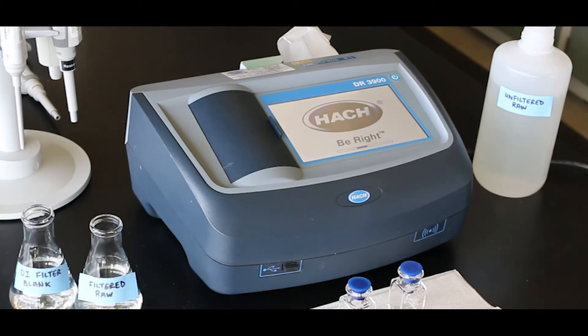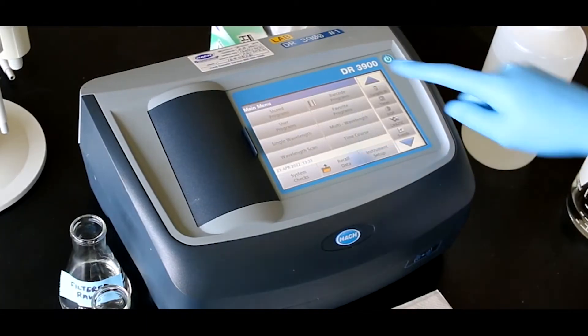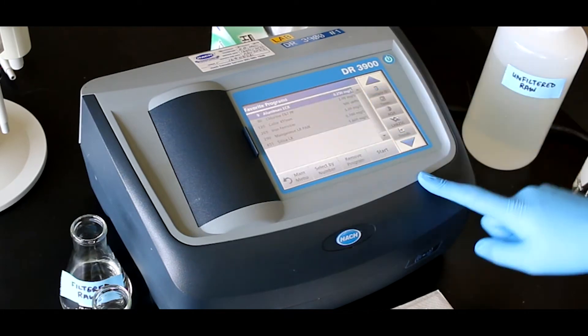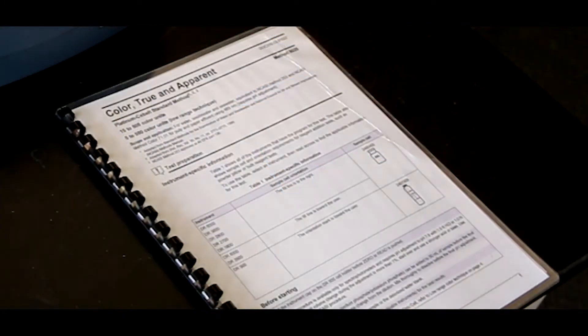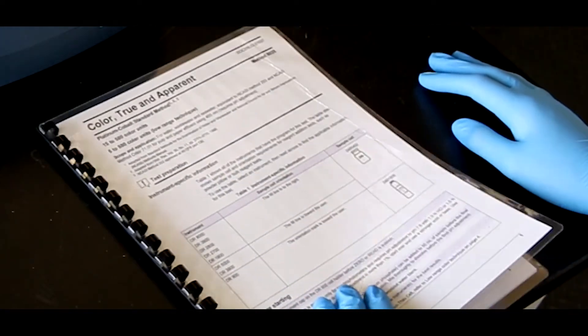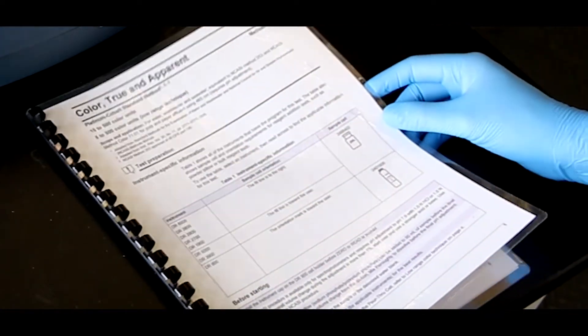We will be using a Hach DR3900 spectrophotometer for our demonstration. Start the instrument and select the appropriate program. Information on sample cells, adapters and light shields can be found in the method.